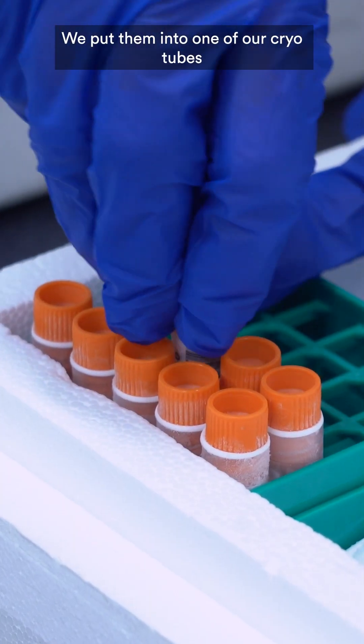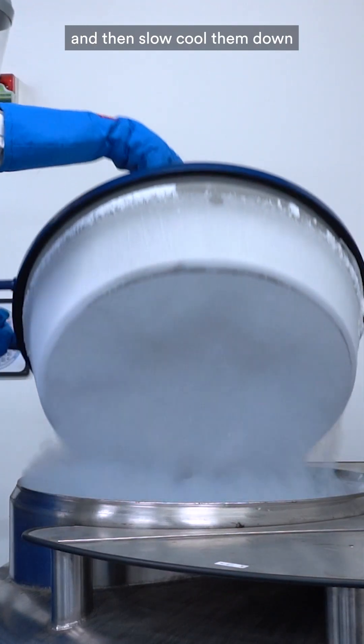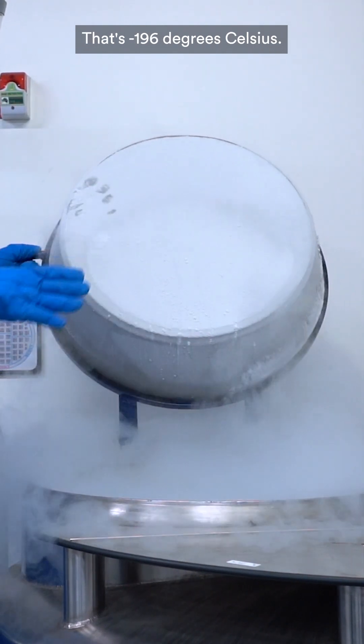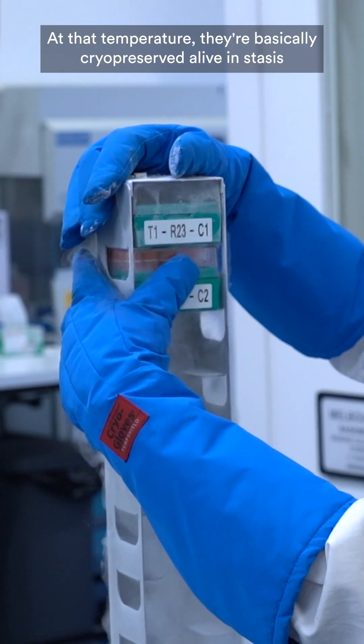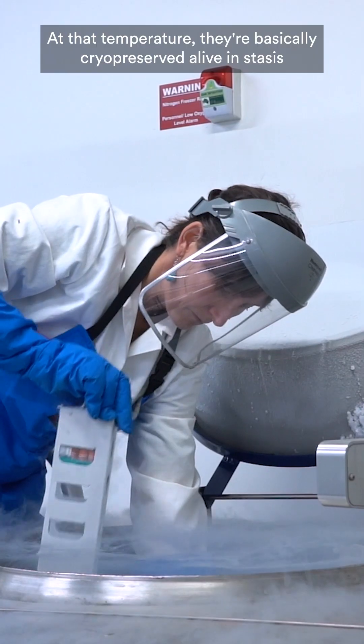We put them into one of our cryo tubes and then slow cool them down to liquid nitrogen temperature. That's minus 196 degrees Celsius. At that temperature, they're basically cryopreserved alive in stasis.